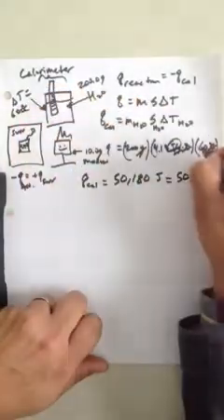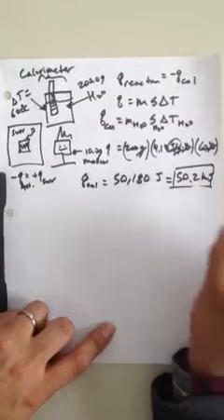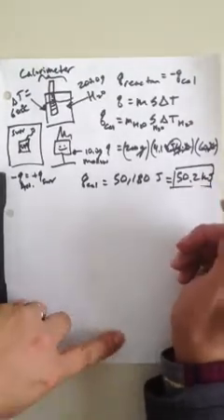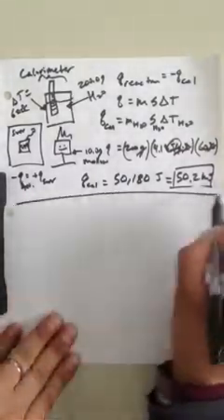What we do now, I gave that 60.0. All right. When in doubt, just use three significant digits, because most things in chemistry are that accurate. Okay. Now we want to say we wanted to compare it to the package.